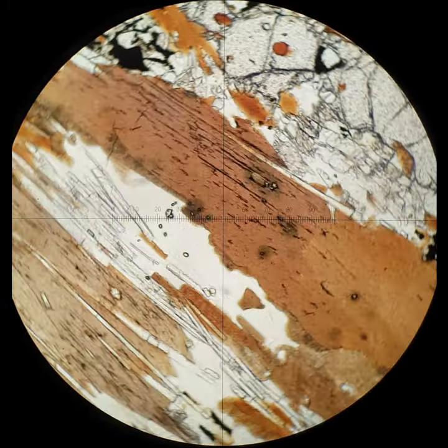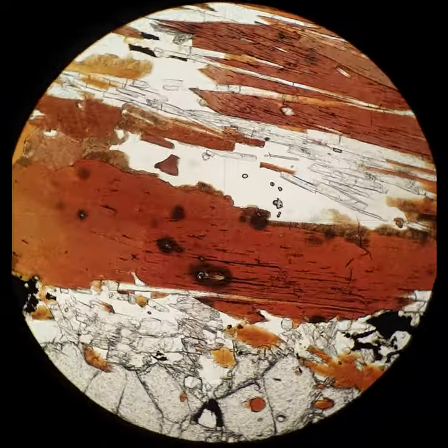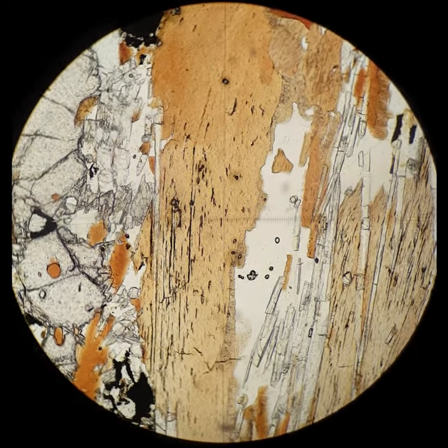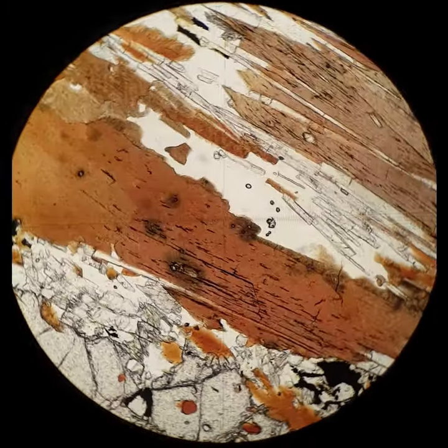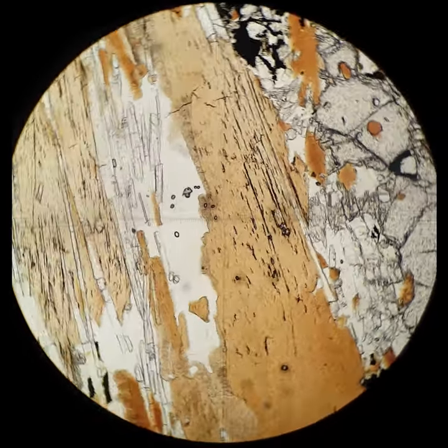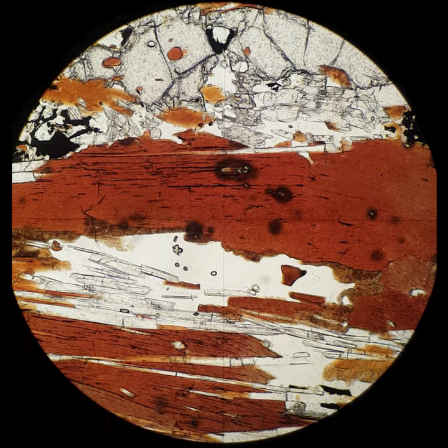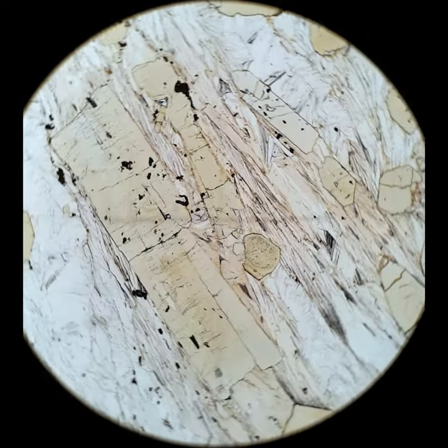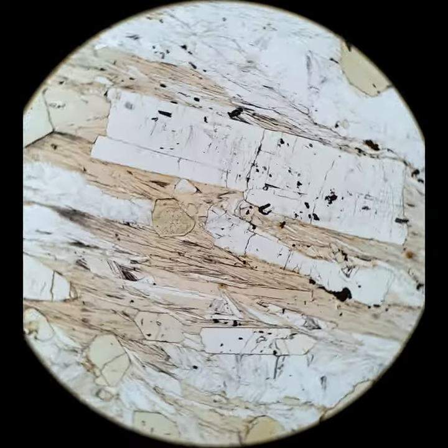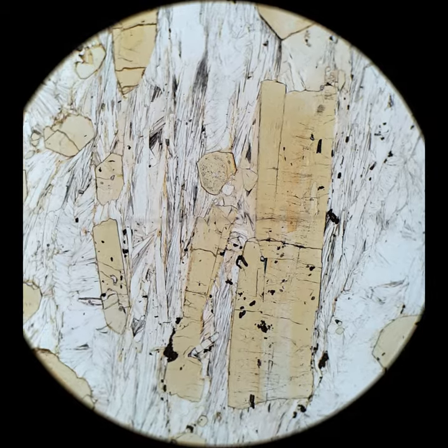Biotite has what we call normal pleochroism — this is when the cleavage planes are parallel to the lower polarizer, and the mineral is darkest. So here, when it runs east-west, the biotite is darkest.